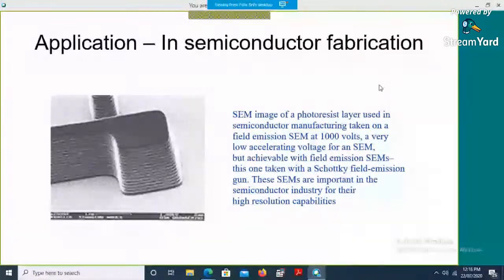Once the patterning is done, you check whether the pattern formed is uniform, appropriate, or has defects. At each stage of electronic fabrication, SEM is a crucial technique, because at each stage you need to monitor whether your IC fabrication is progressing as planned or not. So they use scanning electron microscopy extensively in electronic fabrication.